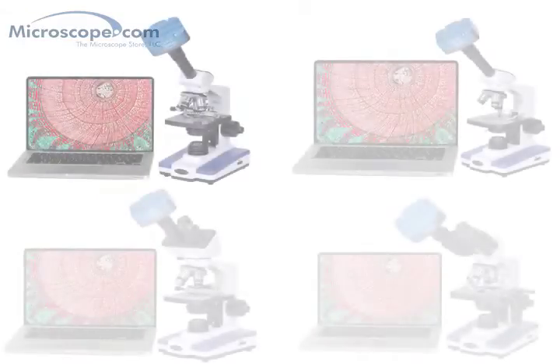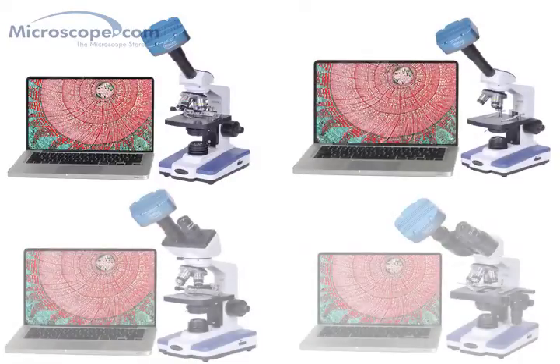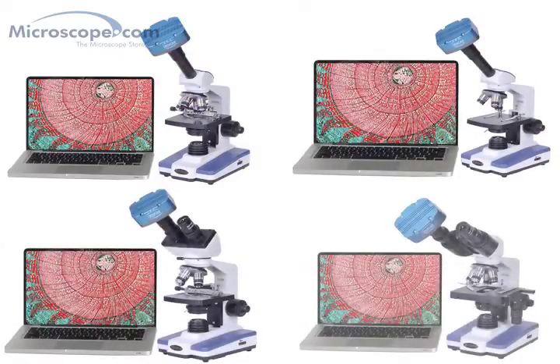Like almost all of our microscopes, this system is compatible with a full range of digital microscope cameras, which are available separately on our website. A camera can be attached by removing the eyepiece and inserting the camera in its place, providing an on-screen live view of the specimen and the ability to capture images for later use.